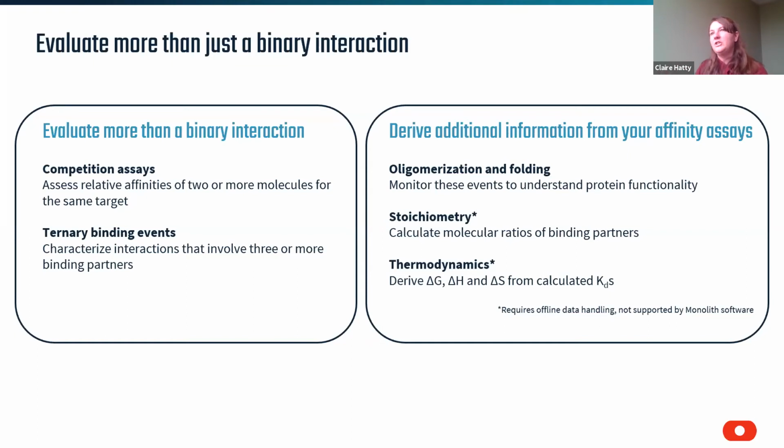There would be some situations where some interactions do change depending on the time. So you might get a different KD depending on which time point you sample. But that's not all interactions. What that tells you is that perhaps the target is being destabilized by heat. But these are things that we flag up, as in which time points you should use to guarantee that you have the least heat change. And if you see this phenomenon, this might be the reason.